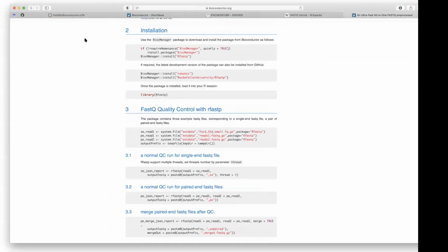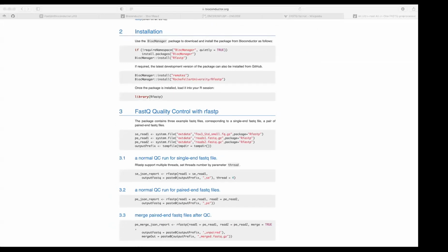What is kind of nice about it, it's not as interactive as what we've just witnessed, which I think is very interactive. But it is very fast. So if you ever wanted to just get some idea of the quality of your data, it's a new package, so we would definitely welcome feedback.